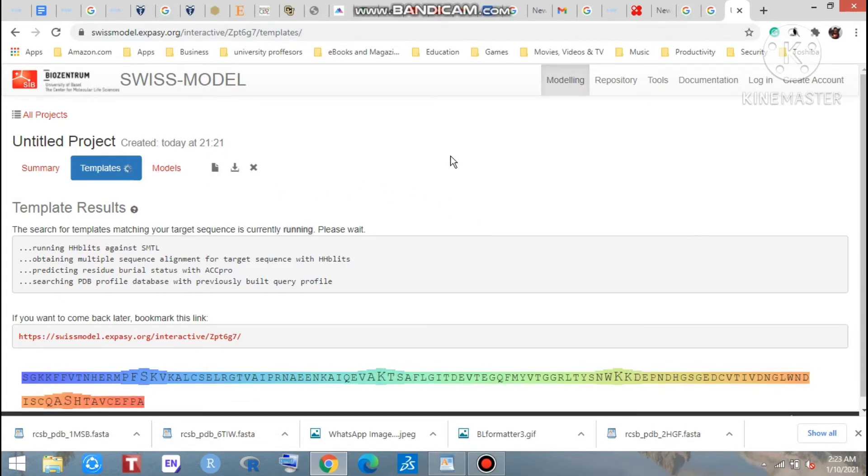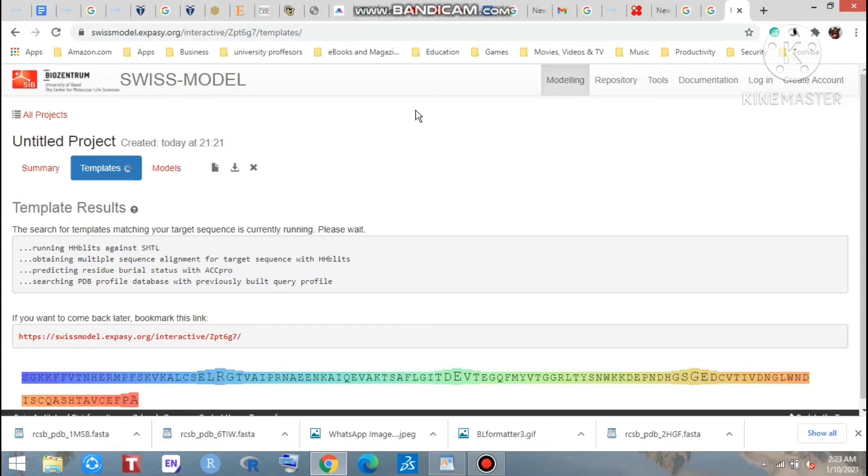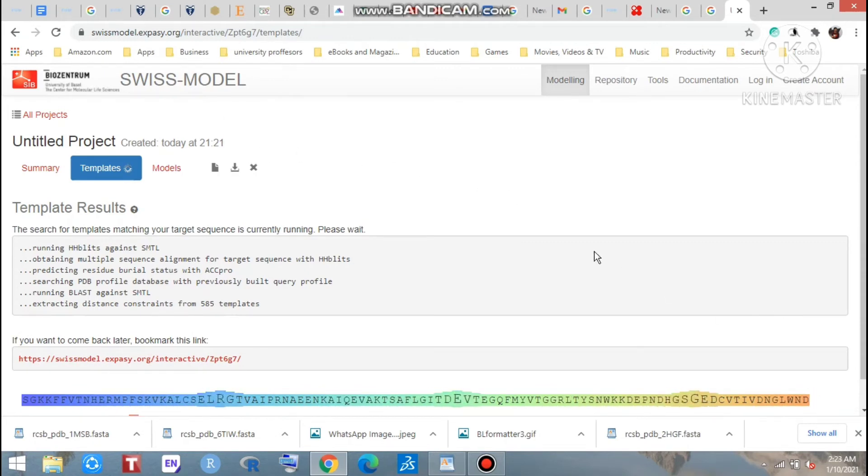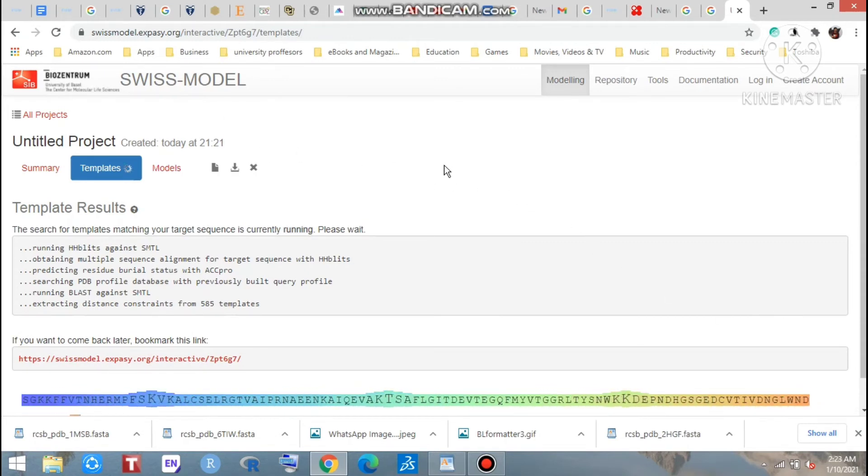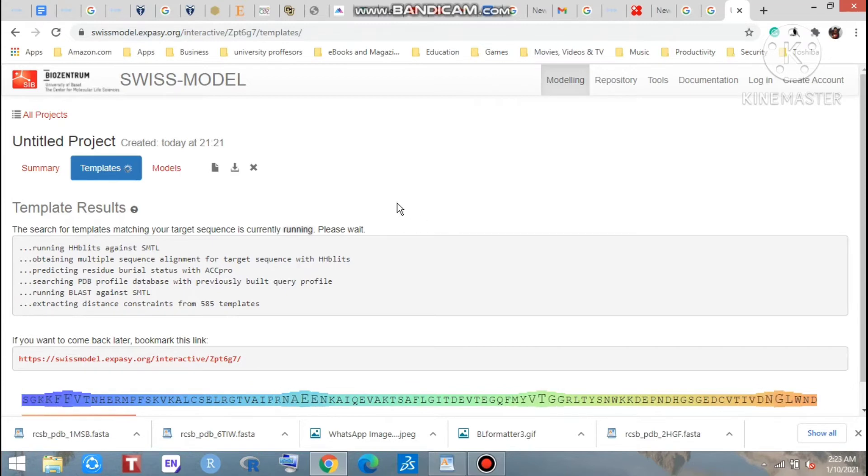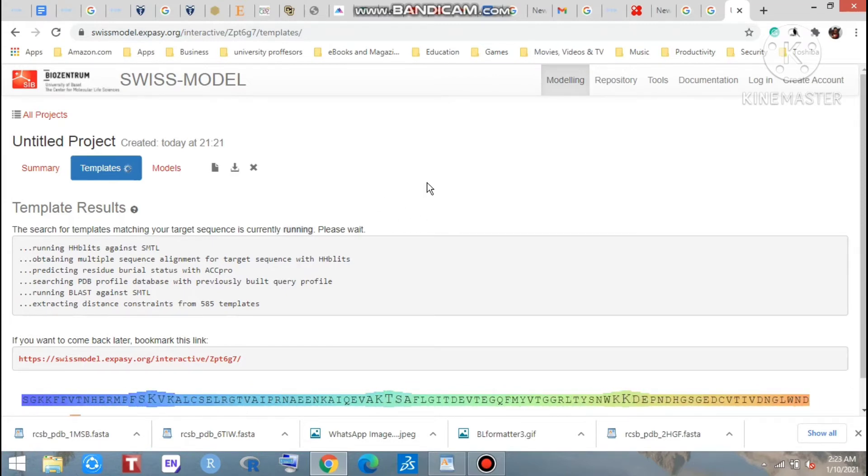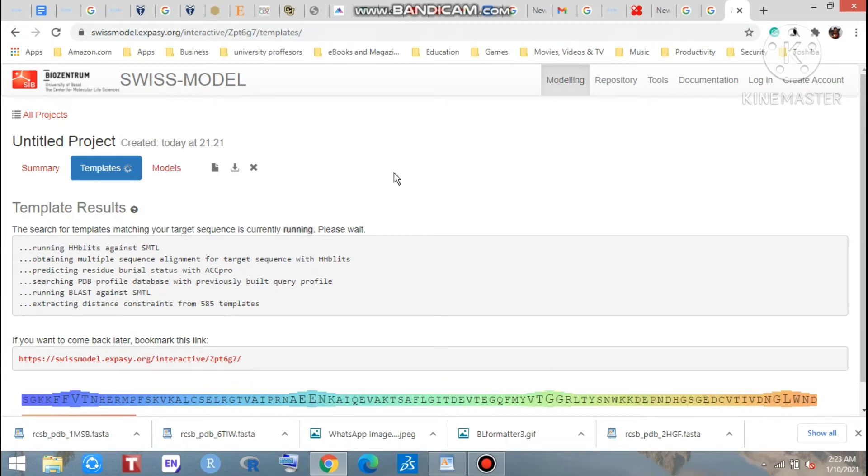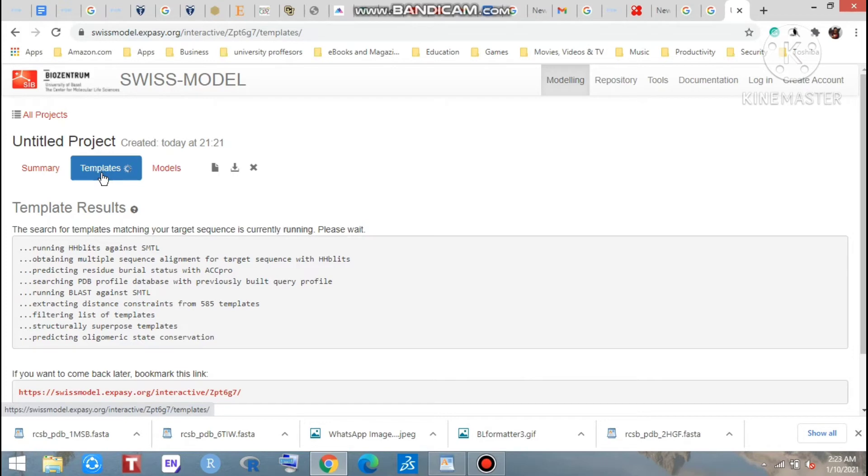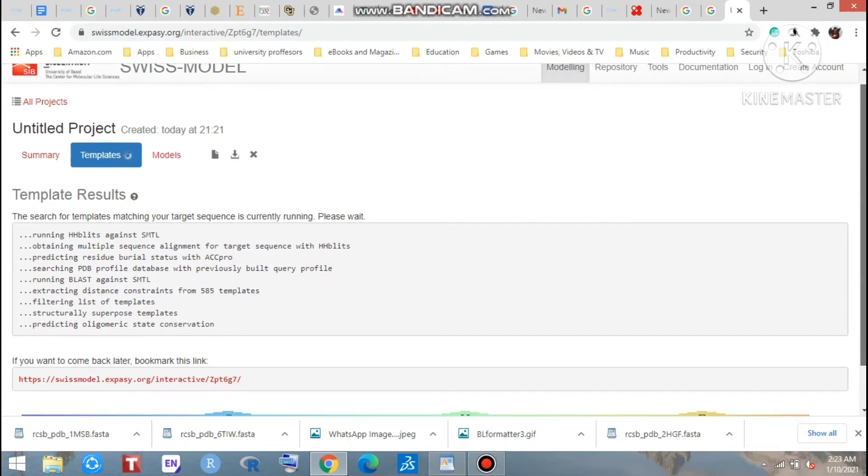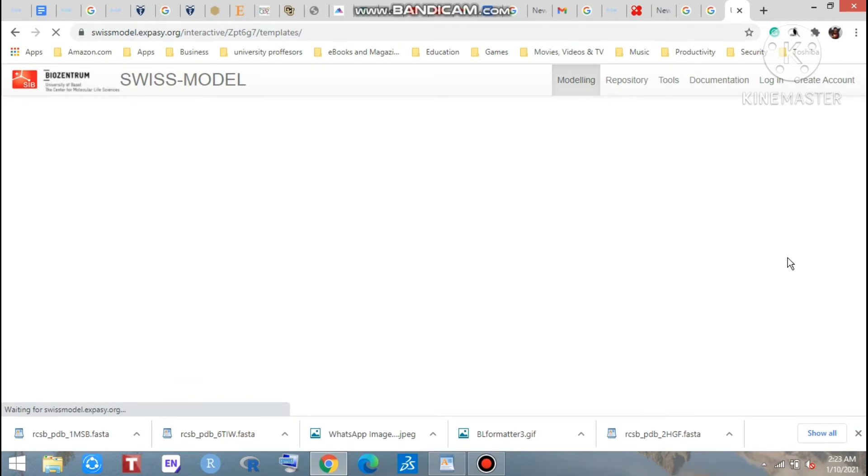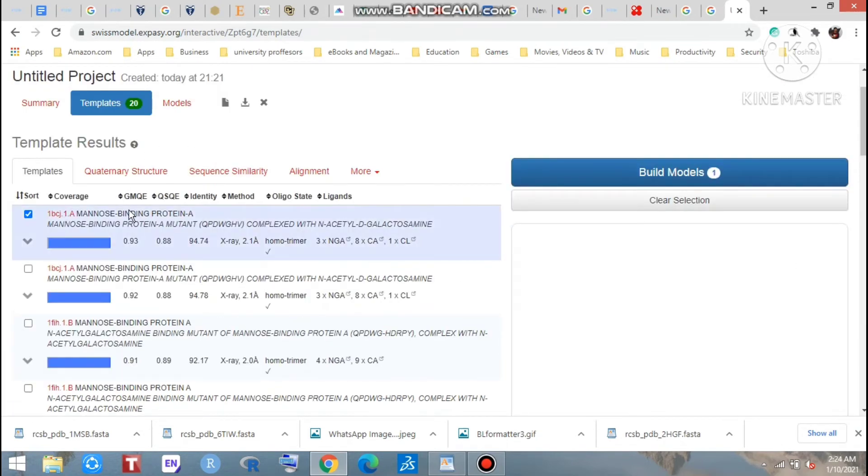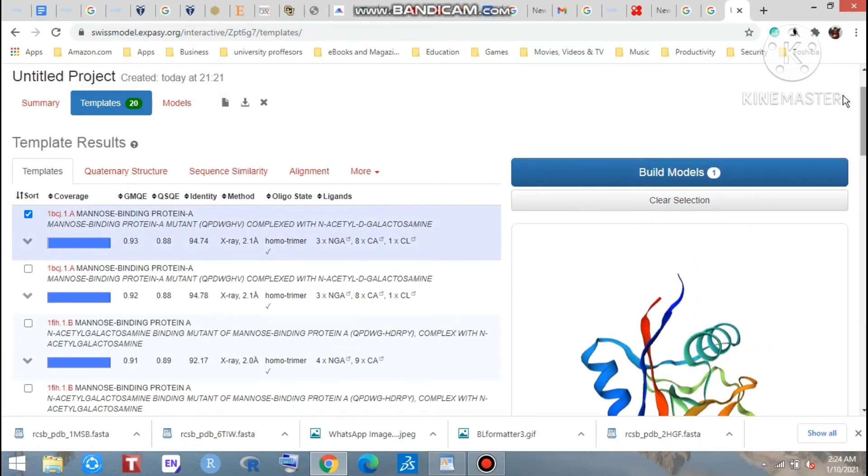It's not like your choice - what is the best for you and what is the best sequence. You don't get this; you will get the sequence through the algorithm. But if we go through this process as templates, then we may get the best result. So wait for some moment. Yes, you can see here are some templates showing.